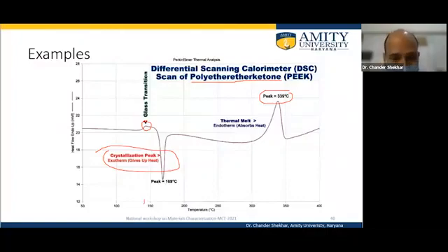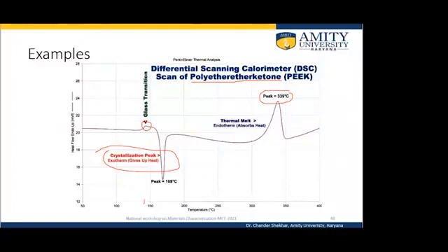It's no issue in that. And there's a question from Anand Selvi. He asks, can you work on proteins and differential scanning calorimetry? Do you get a peak for protein molecules?